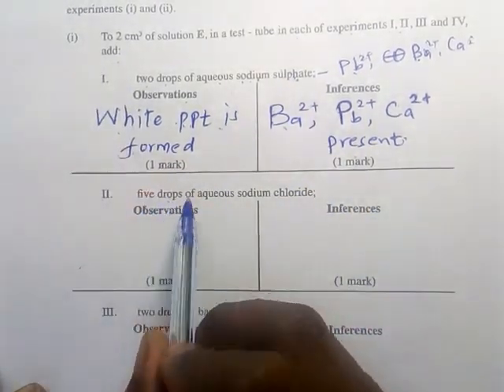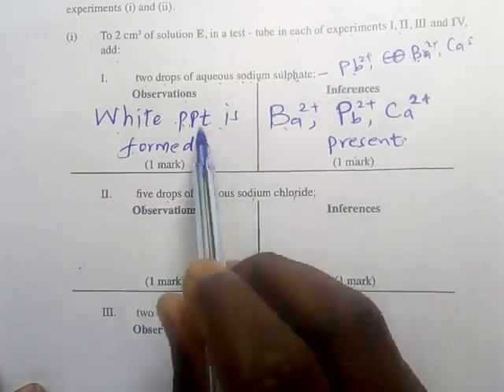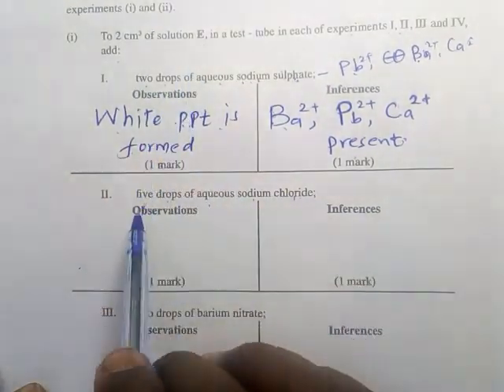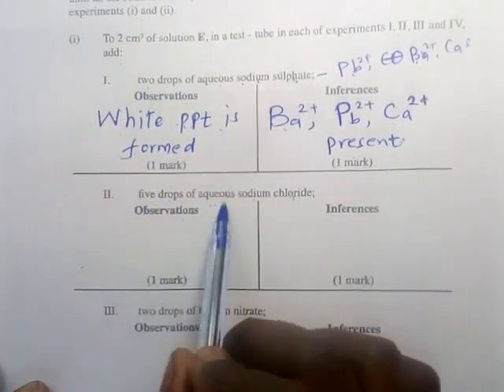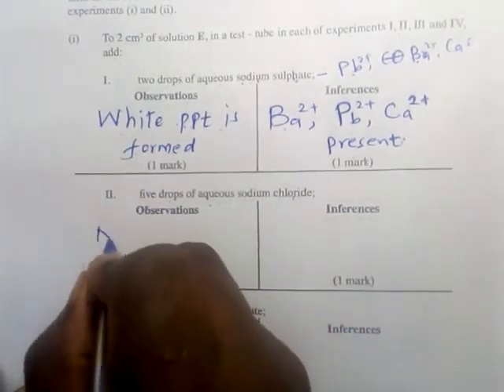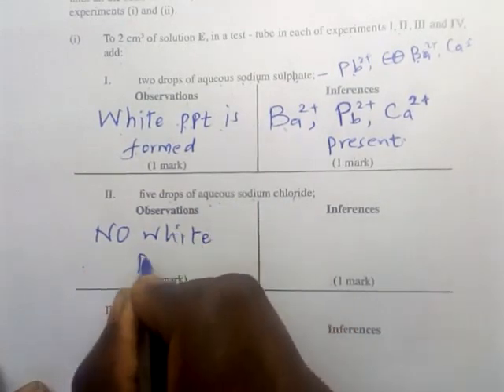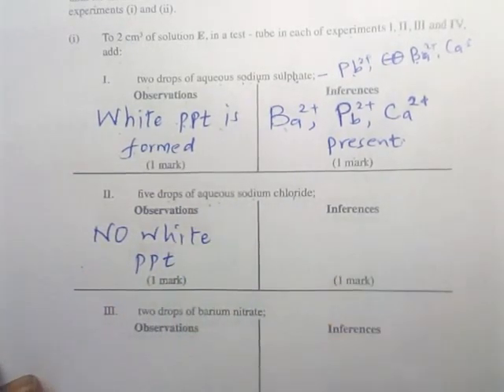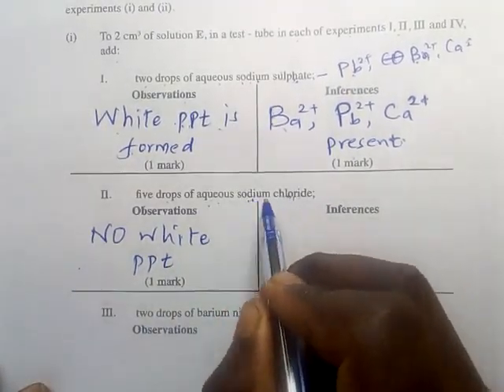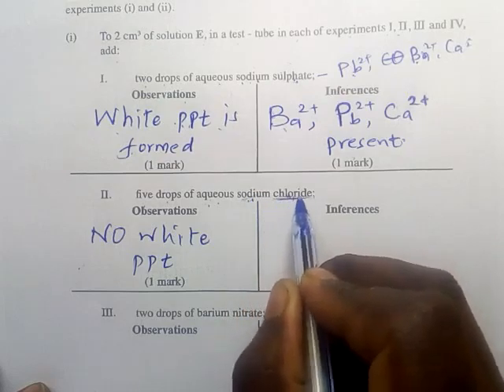Add 5 drops of aqueous sodium chloride. We are adding sodium chloride to solution E. So to about 2 centimeter cube of solution E, we are adding 5 drops of aqueous sodium chloride. The observation is that no white precipitate is formed. We expect the chloride to form a white precipitate because sodium, we don't care about it. We are concerned about the chloride.